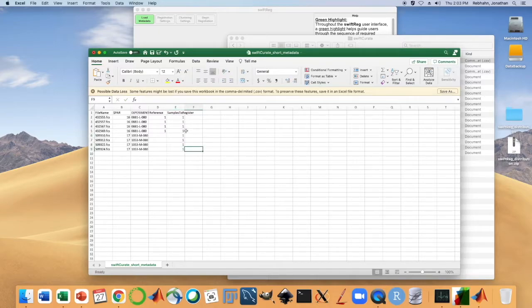So from these 2 batches, the first batch is going to be aggregated and registered to itself. There's an important reason for this. You want to subject all your samples to the same manipulation, just to be fair. And the second batch is going to be aggregated and then registered to this reference as well. And then we want to apply those batch shifts back to the original samples.